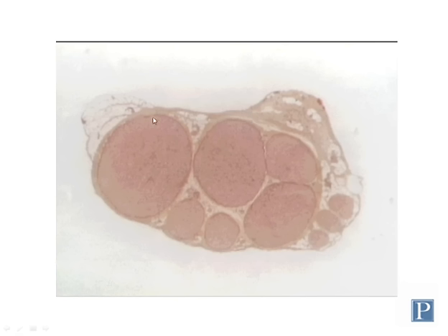Within the Epineurium, you can see several large spherical appearing structures. These are bundles of axons in cross-section, and bundles of axons that are found inside nerves are called fascicles. So here you can see 1, 2, 3, 4, 5, 6 fascicles, and some more over here. Fascicles can contain dozens or hundreds of axons, both myelinated and unmyelinated. Some are smaller than others, as you can see here.